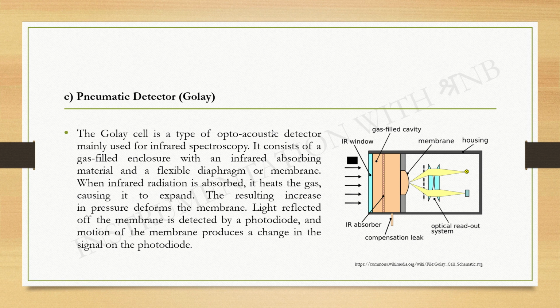Pneumatic detector or Golay detector. It is basically an optoacoustic detector where we use an IR absorber and there is a gas filled cavity. So when IR radiation is absorbed, it heats the surrounding gas and will result in the expansion of this gas.